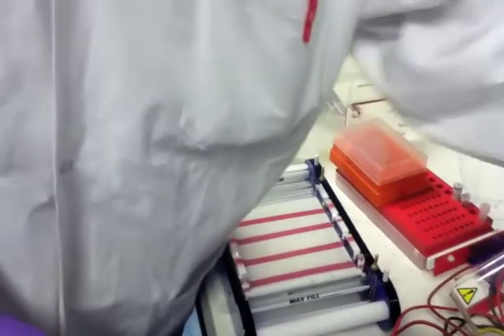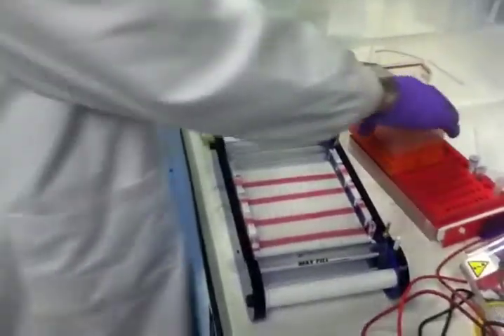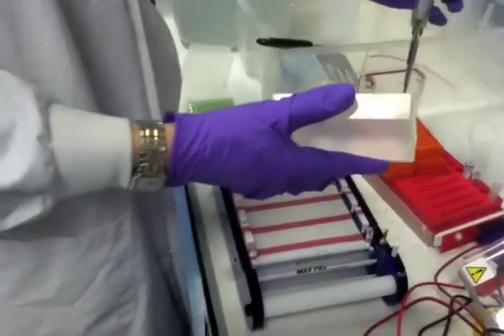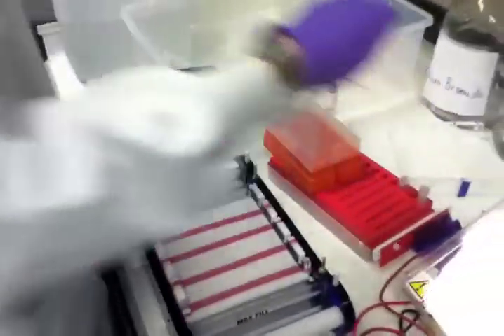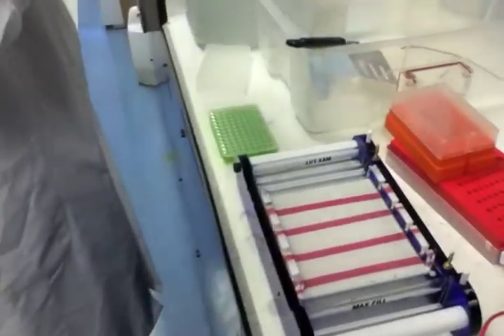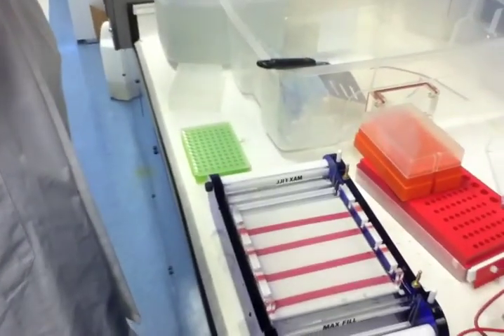So I just loaded ladder. That's the DNA marker, a reference point. We'll be able to determine what the lengths of each fragment are. And now I'm going to actually load your samples.